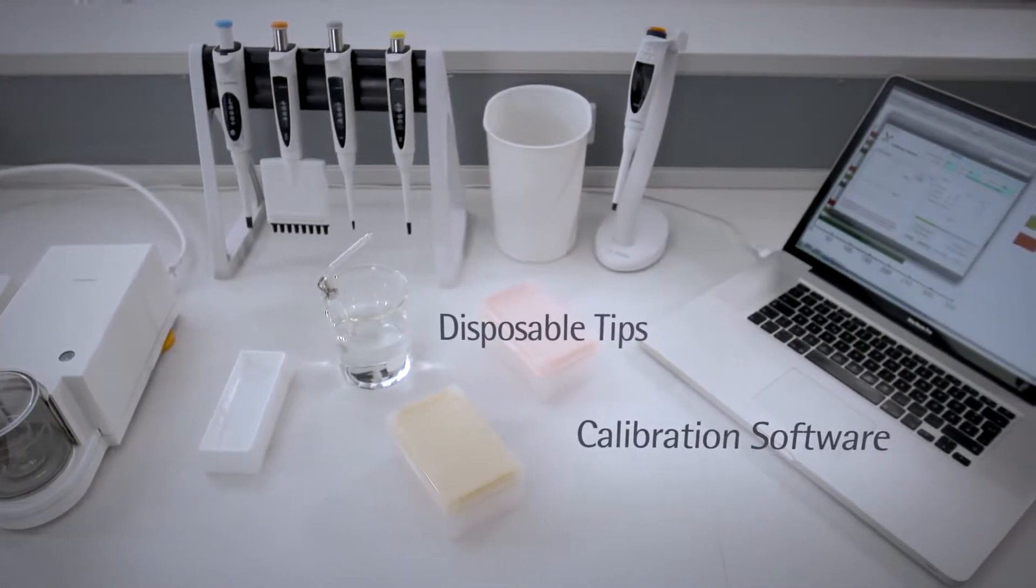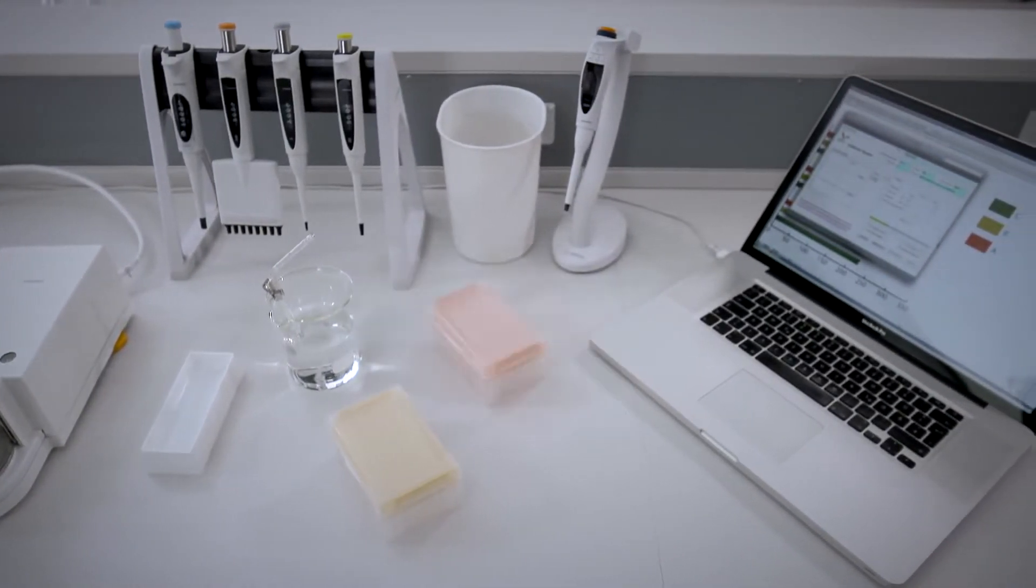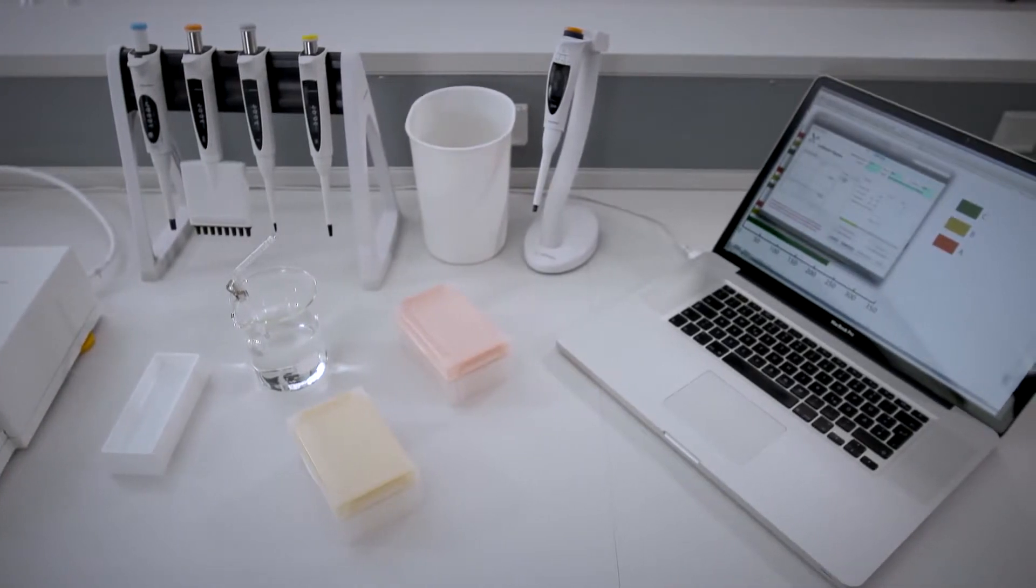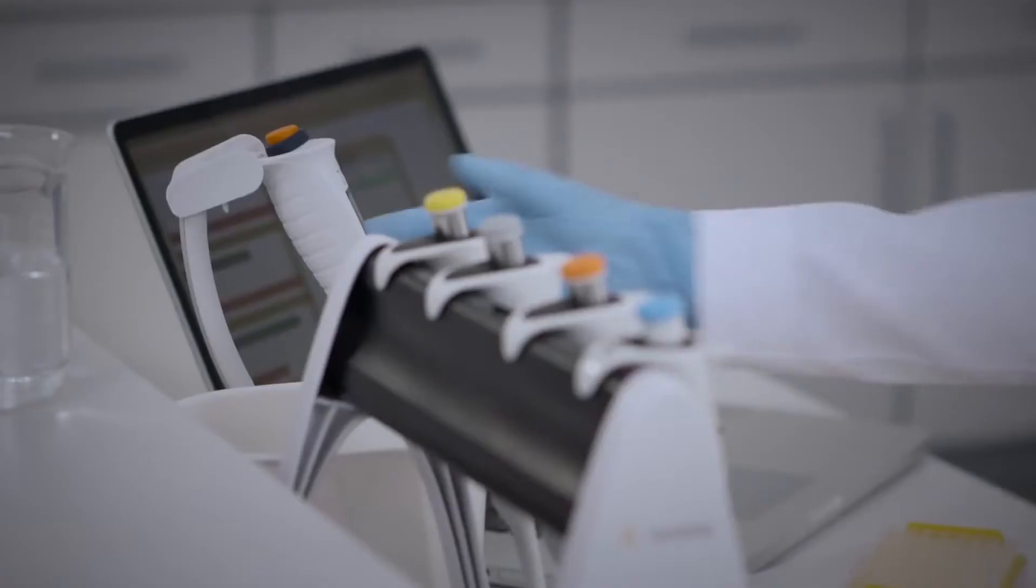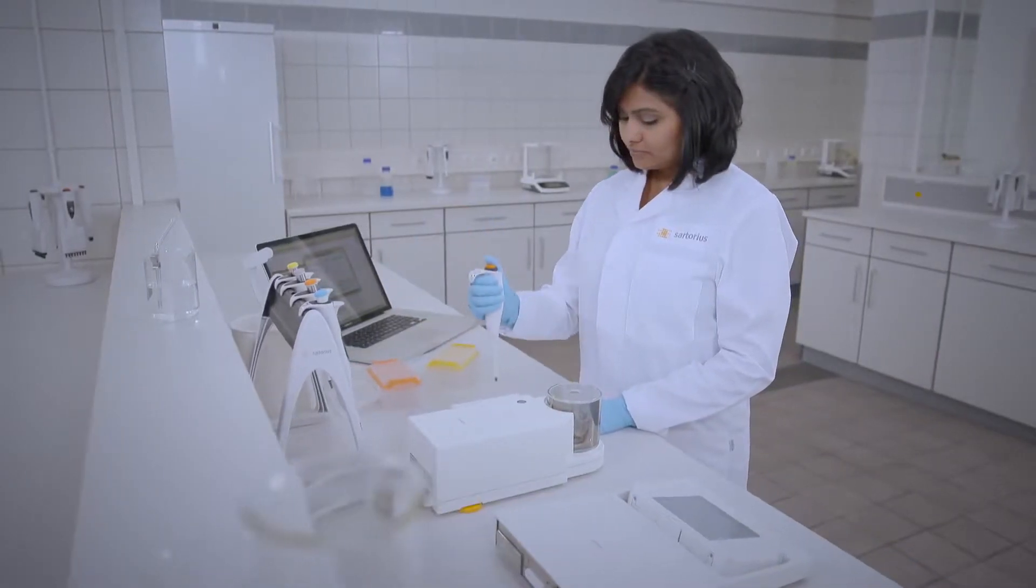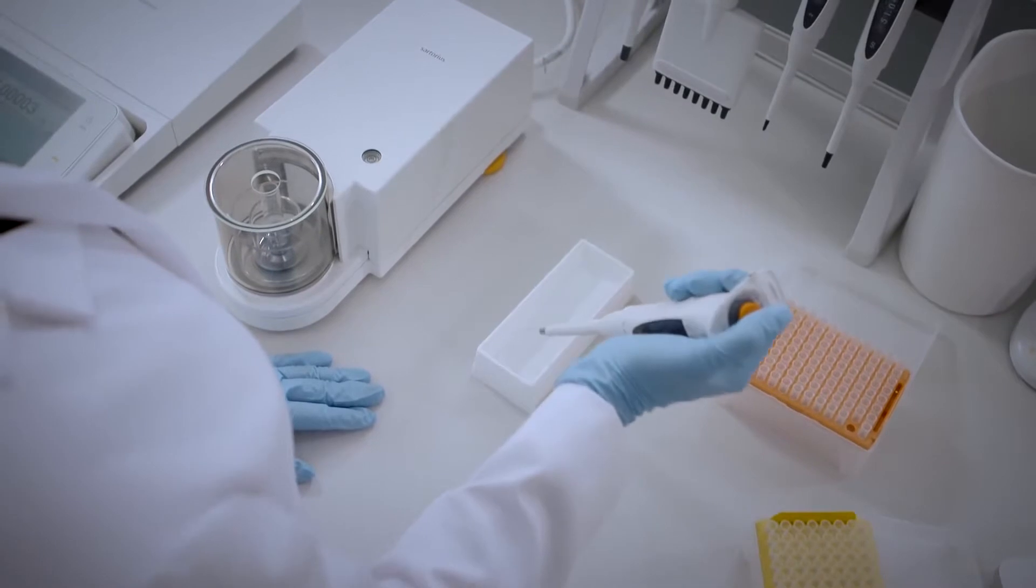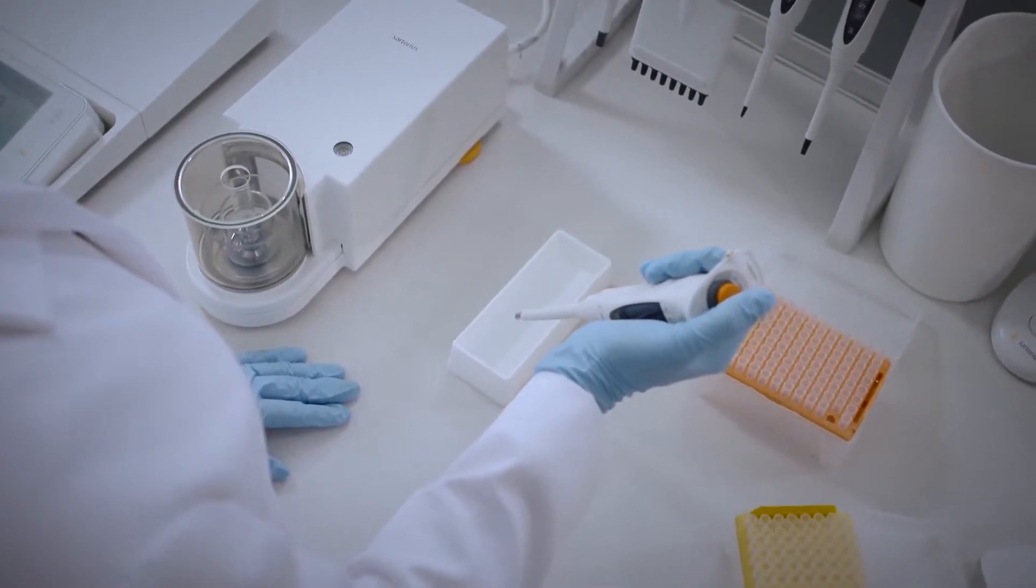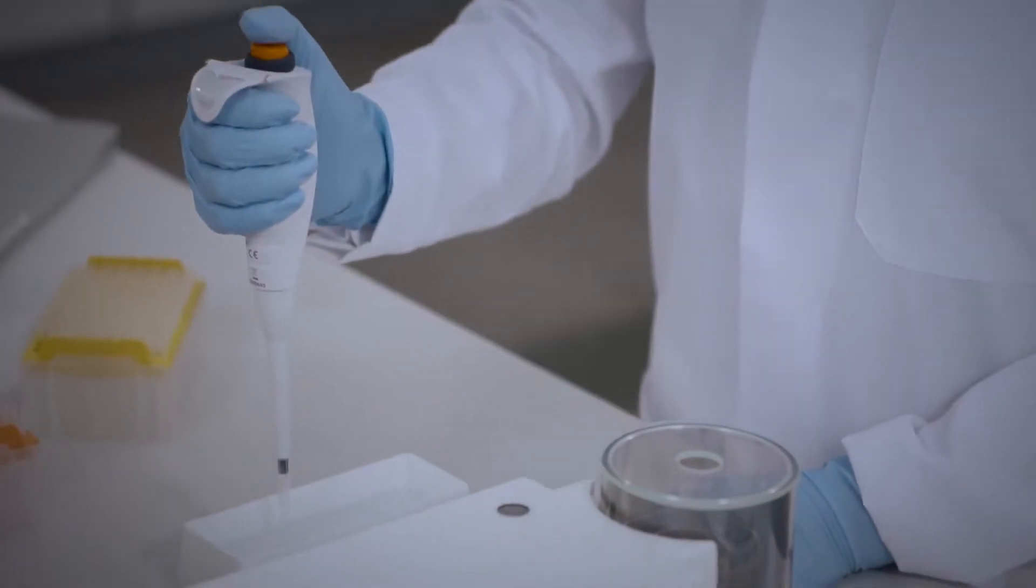Besides the equipment, the procedures are also important for the reliability of calibration results. First of all, it's important to pre-wet the pipette three to five times before starting the calibration to eliminate evaporation of the water into the airspace inside the pipette.